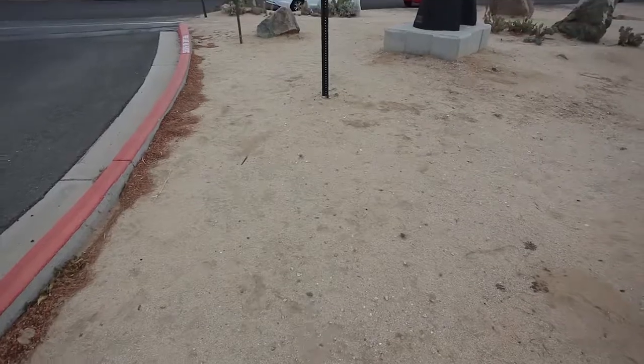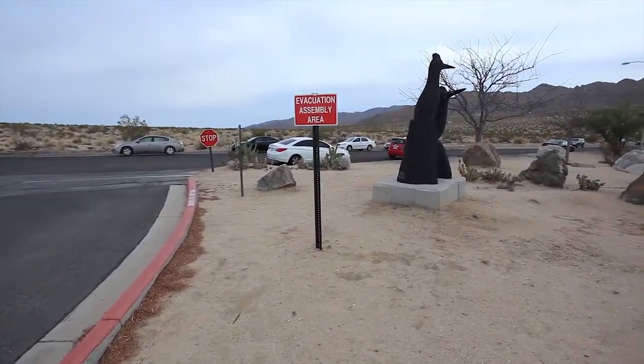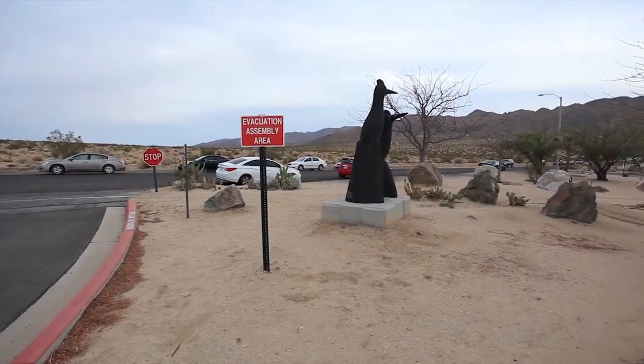How do you use one, you said? Great question. Pull the pin, aim at the base of the fire, and squeeze. If a fire becomes too large, stay calm, exit the building immediately, pull the fire alarm, and meet in the designated emergency location. In your case, the staff parking lot.